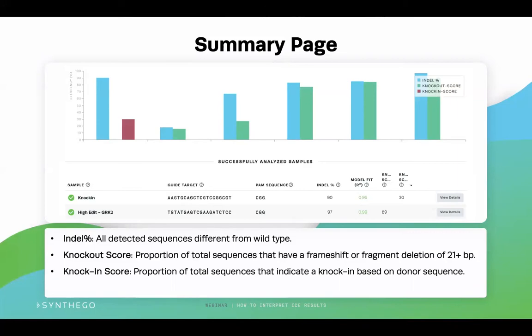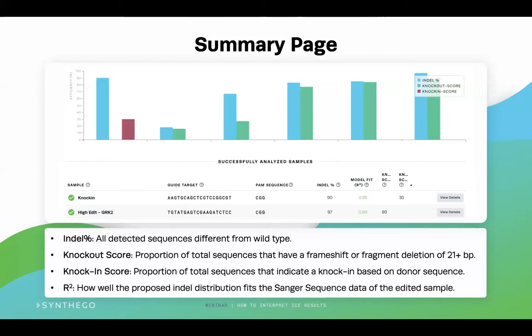The red bar is the knock-in score. This is the percentage of the sequences in the sample uploaded that contain the desired knock-in sequence. You can also find the model fit, or R-squared value, for each of your samples. The R-squared value is how well the proposed indel distribution fits the Sanger sequence data of the edited sample. It should be noted that if you are doing a knockout experiment, you will only see a blue and green bar representing the indel percentage and knockout score. If you are doing a knock-in experiment, you will see the blue and red bar depicting the indel percentage and knock-in score.